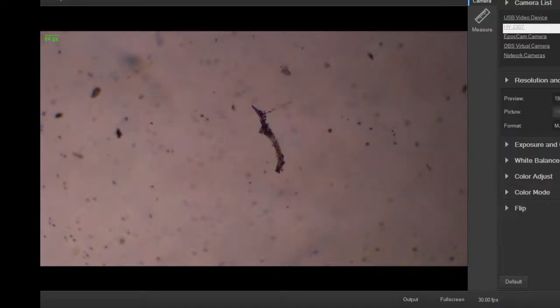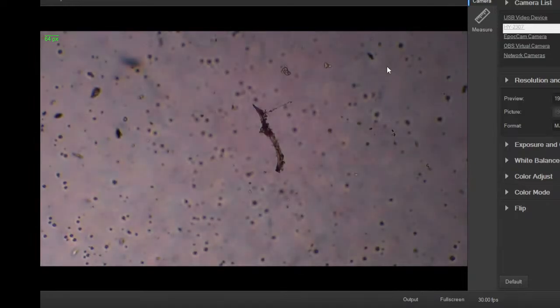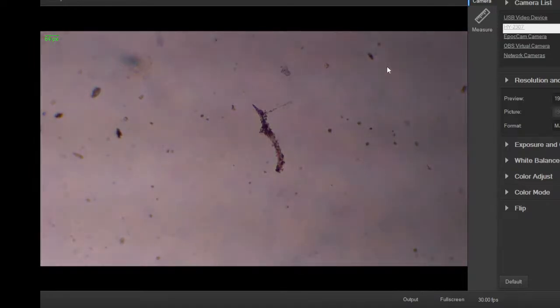So, let's see what we can see. Adjust my window here. More brightness and contrast. Take a look around for little critters.